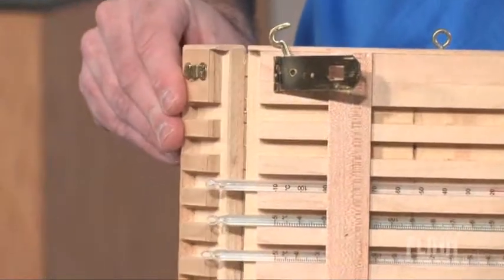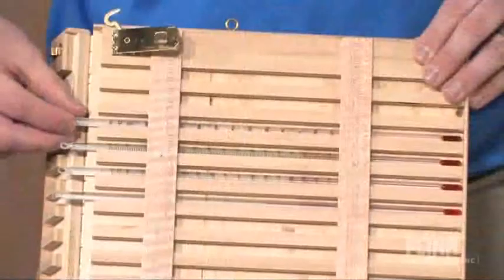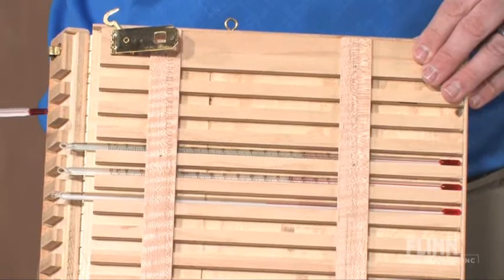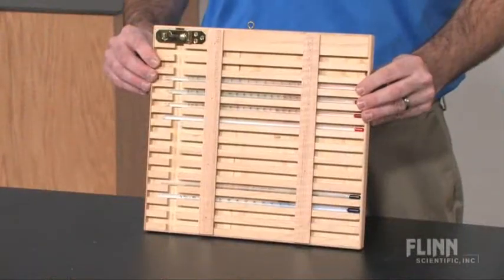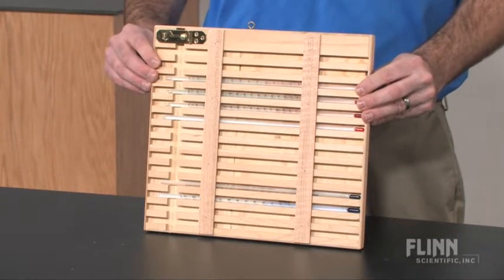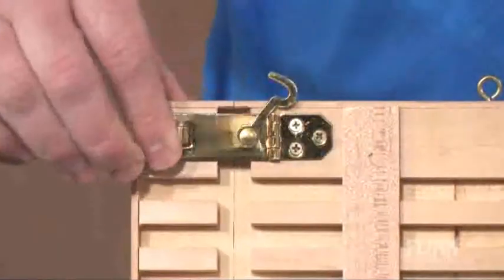The rack is hinged so it can be easily placed in the lab. On days thermometers will be used, students can simply take their thermometers from the rack and return them upon completion of the lab. The rack measures approximately 12½ inches long and 12 inches wide, accepts 14 twelve-inch thermometers, and can be folded, locked, and stored.